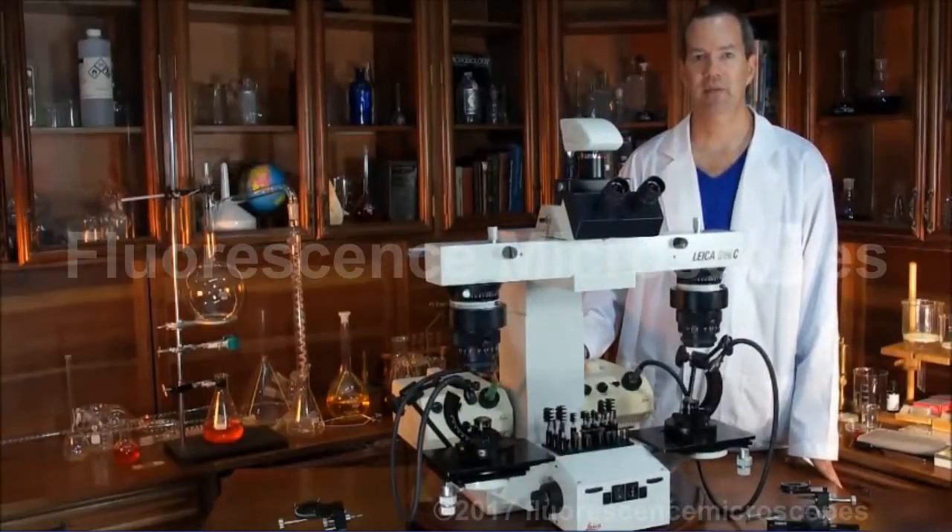This is a Leica DMC Bullet Comparison Forensic Microscope, also called a macroscope.